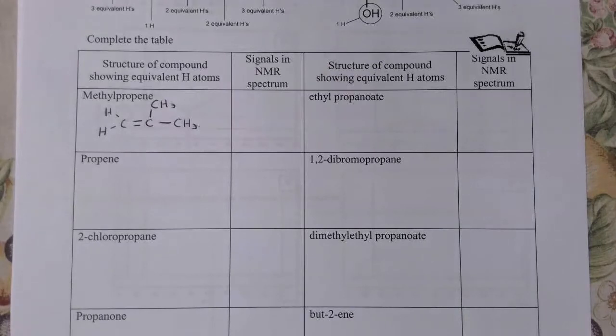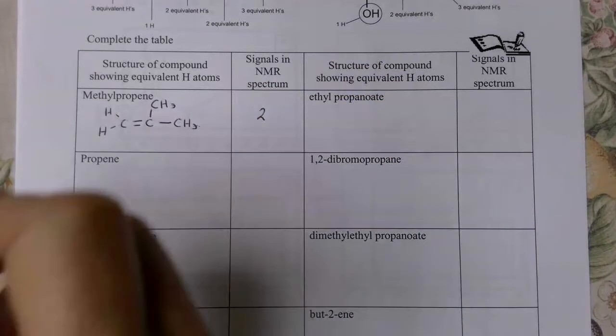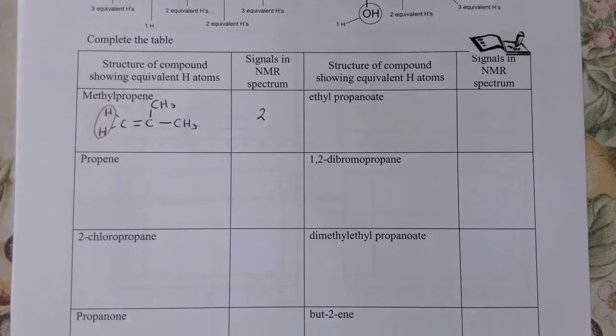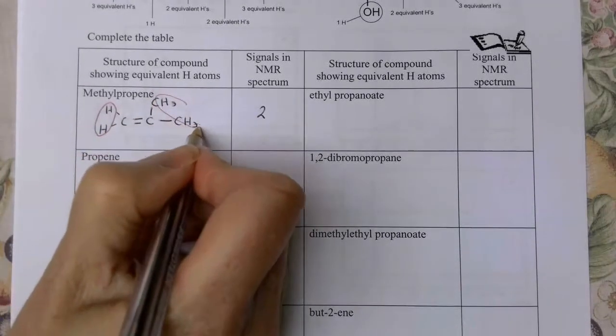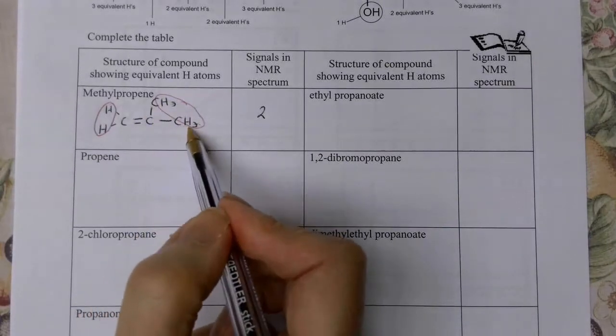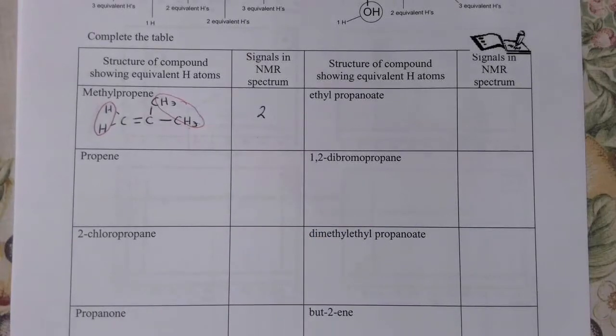So in this case, I have two hydrogen environments. These hydrogens here, they are in the same environment. So that's one environment. And then these 6 hydrogens here on these two CH3 groups, they are again in the same environment. So that gives me two signals in my NMR.